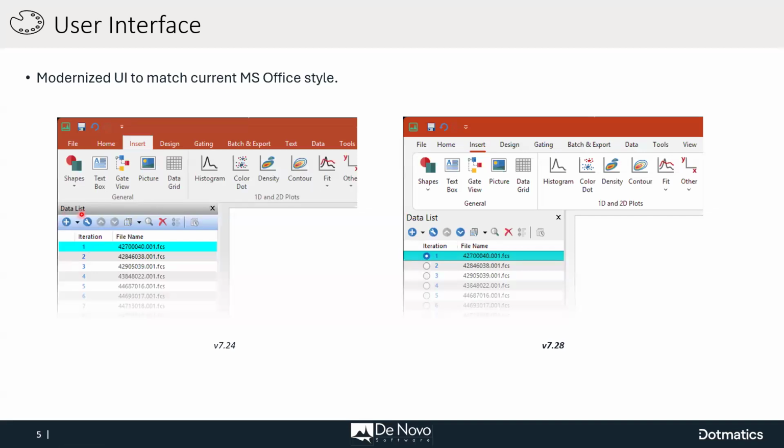You can see here, dialogs used to have a header and a toolbar with some shade, in this case light blue. Now it's flat gray. And this also comes into play with dark mode. So it's a much cleaner interface. We try to make things as simple as possible, also visually and graphically.